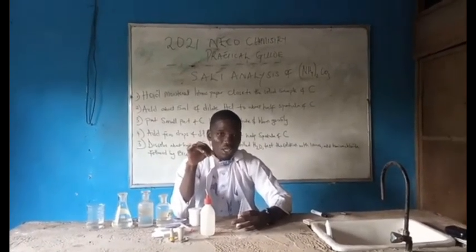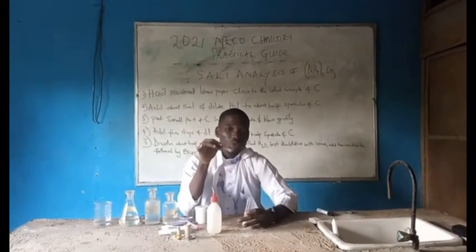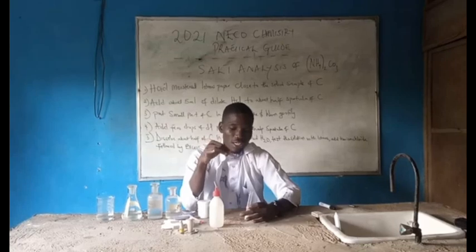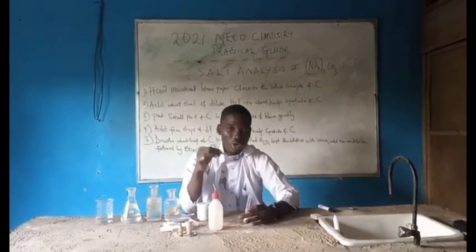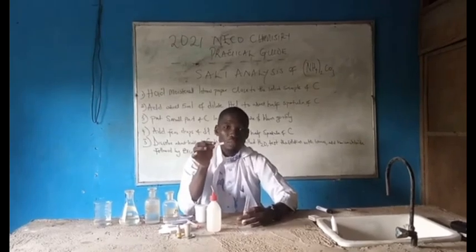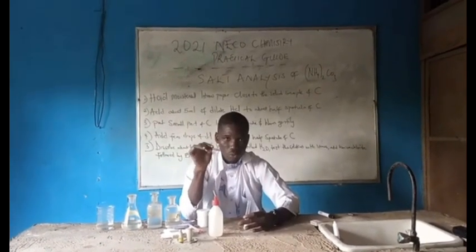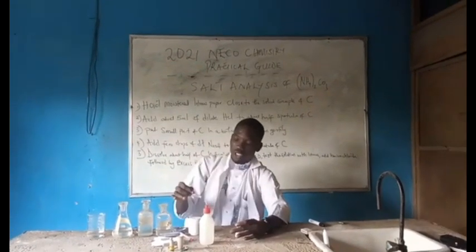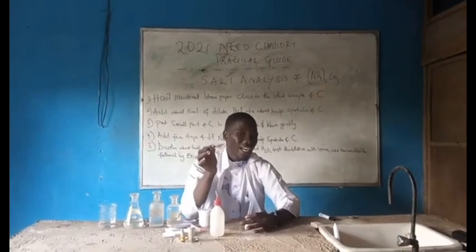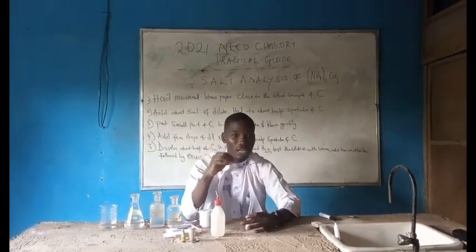So under your test, it said sample C plus distilled water. Again, sample C plus distilled water. So the observation would be sample C turns red litmus blue. And what will be written for the inference? So you can say sample C liberates an alkaline gas, because an alkaline gas changes a red litmus paper to blue.